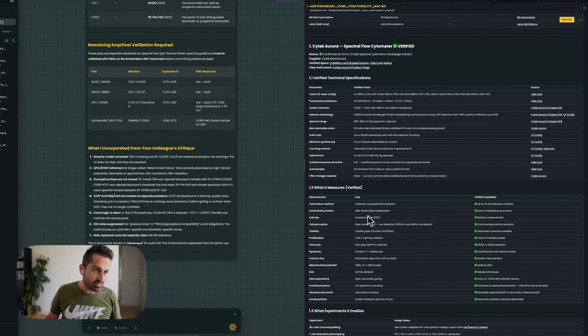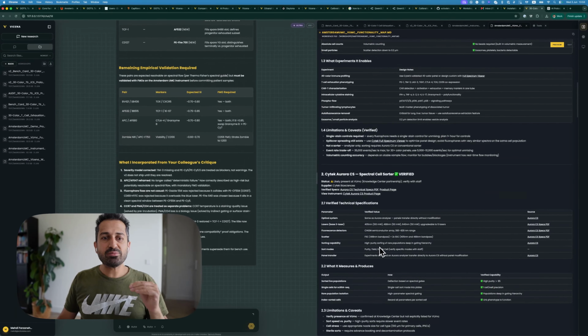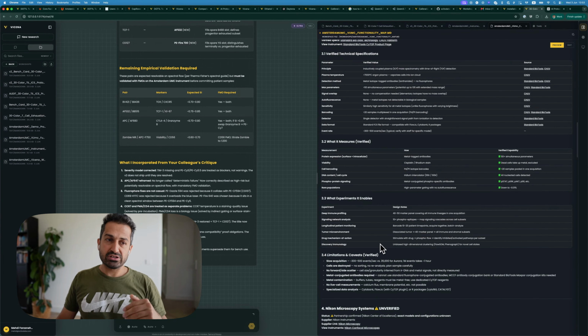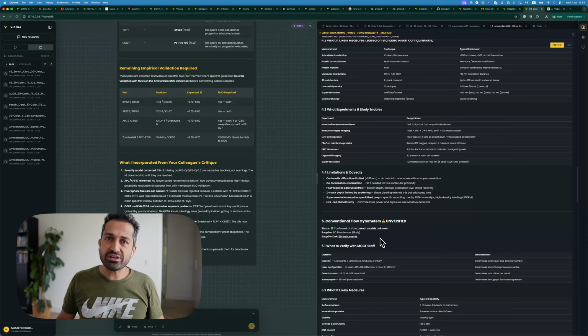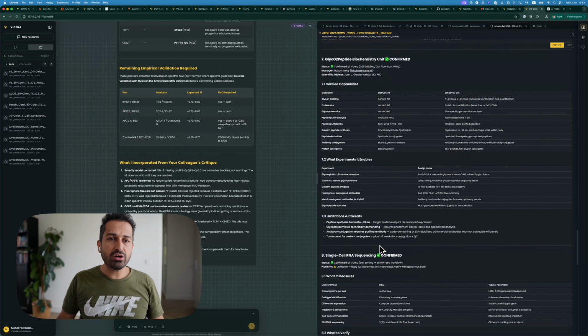For example, if it's antibody or forward scattering, and all of the low-level experiments which can be done using this equipment. Of course, this is not an exhaustive list, but this is essentially most of the experiments that can be done using the setup that is out there, right? And all of them verified.